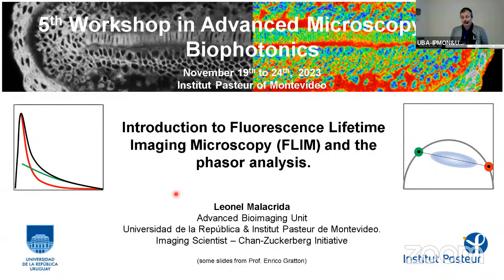So now it's my turn, and I am going to talk about fluorescent lifetime imaging. I am glad that they gave a very good introduction, so my show will be much easier and simpler. But my idea is to convince you that if you start from, as they say, a pulse, and you have a quick decay or a long decay, you can see this and this as equivalent analysis.